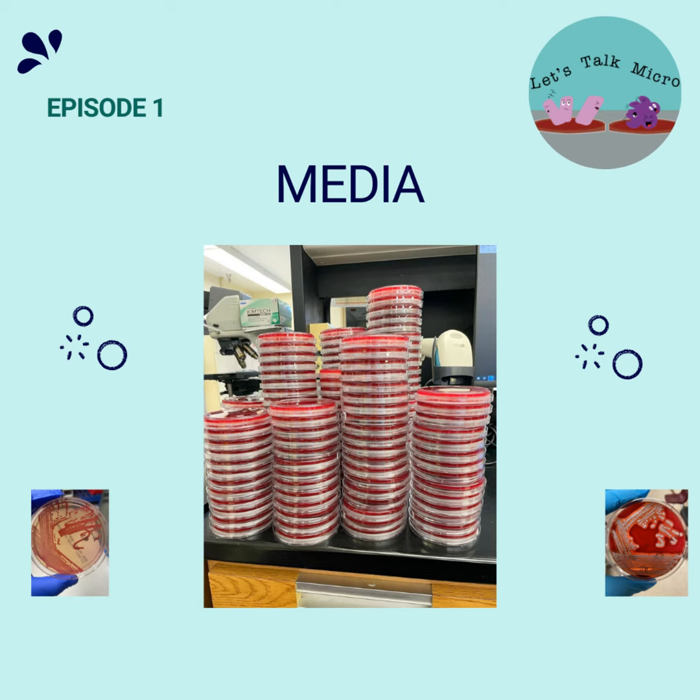Like I mentioned before, you do quantitation for urines and bronch washes, and for the other cultures you actually streak for isolation. In the same way, if you're trying to get a specific organism that might be mixed in your plate by itself, you use that type of streaking, the isolation one. And then you have your media, you have inoculated your sample, you streaked them, and they're ready to go to the incubator so they can start growing.